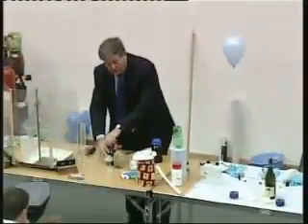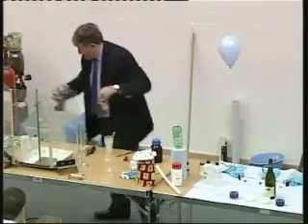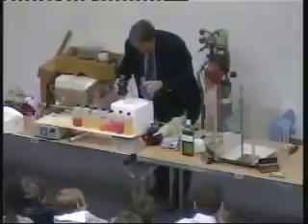So I need the lights really right out for this because it's quite a weak effect. I'll put it along there so you can see it, right? On top of there. Right, can we have the lights right down, please? Now I can't see where to put it. There we go. All right, now we can go down. And that's the 2 together. Right. So, that's cold chemical light.